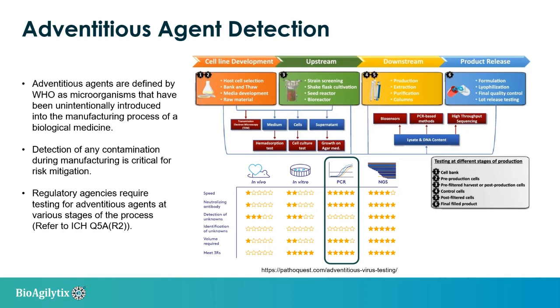However, it makes the assay more complicated. In addition, as these methods can take weeks or even months, they're often the pacing item for the batch release.